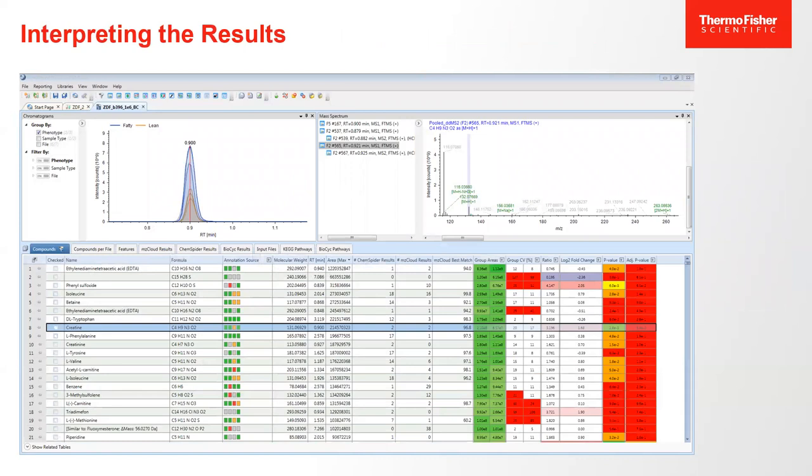Okay, no matter what, the basic three steps amount to, I'm going to create an extracted ion chromatogram of that particular chemical. Extracted ion chromatogram is just a particular mass plotted over time to make an LC peak that we can integrate and get the peak area for. And in this case, you can see different classes of organisms producing different heights. And we can see blue being tall versus orange being shorter, about 2 or 3 to 1 difference. Is that visually clear that everyone can see those differences? Okay. That particular chromatogram allows me to calculate a ratio.